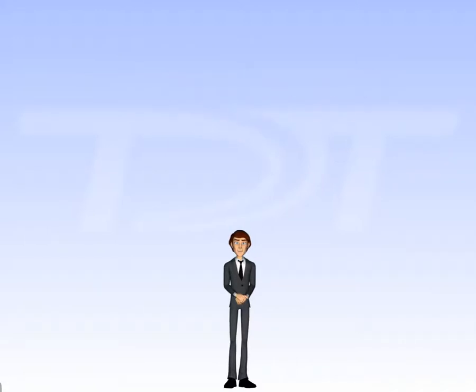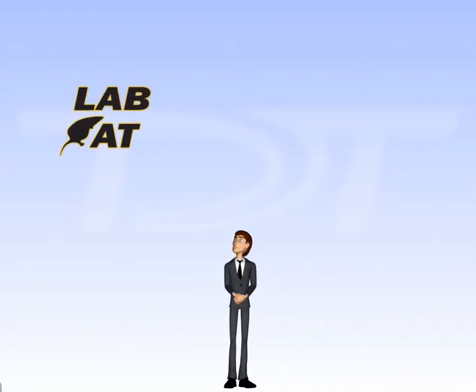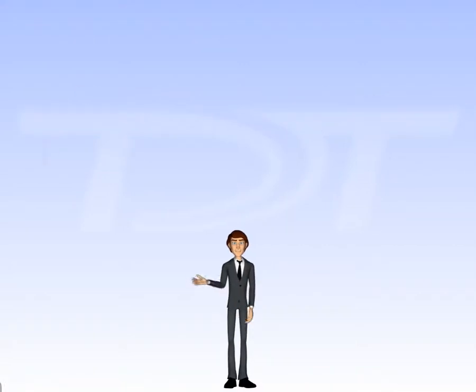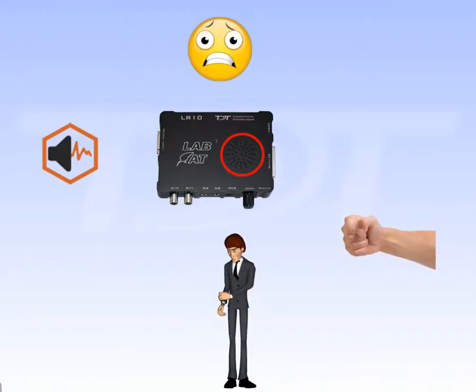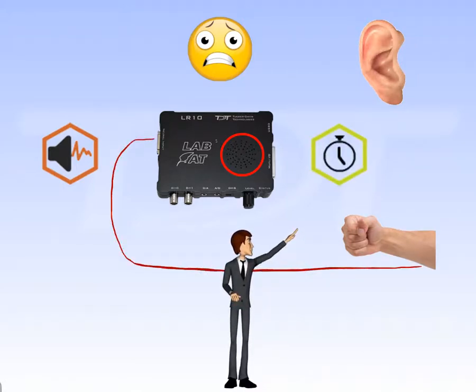This will be a simple stimulate and acquire experiment to demonstrate the amazing capabilities of lab rat and the Synapse software. In our experiment, we will use the audio stim gizmo to play a short tone burst from the lab rat speaker. You, as the subject, will clench your fist when you hear the tone. We will use your EMG signal burst and the timer gizmo to measure the latency of your response.